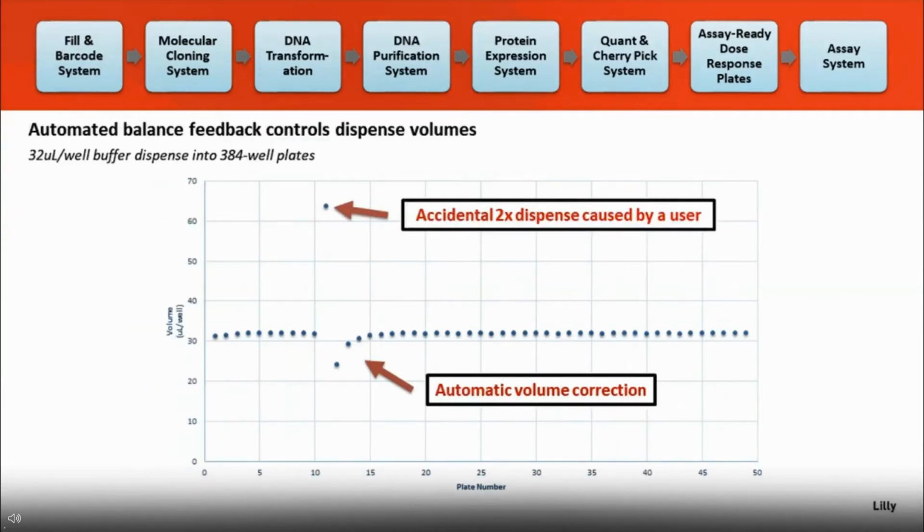And so what we've done with Beckman, and other people have done this with other scheduler softwares and integrated dispensers as well, is to have the feedback loop and to have the software control dispense volumes. So in the case of the WD2s, we are able to use that information, feed it back to the dispenser, and as it drifts down, it bumps it up and keeps it dead flat for the course of a run.